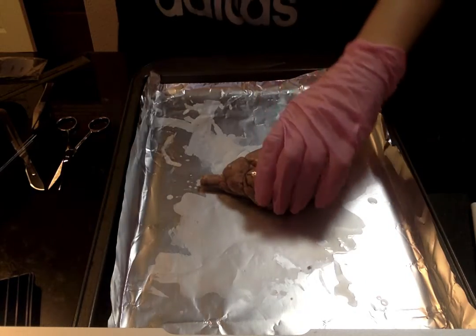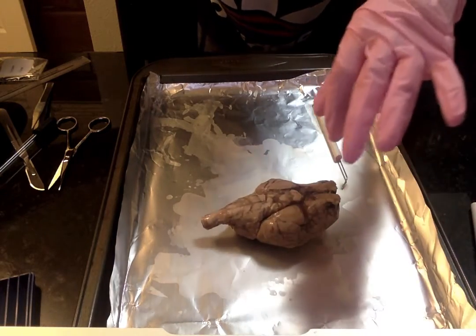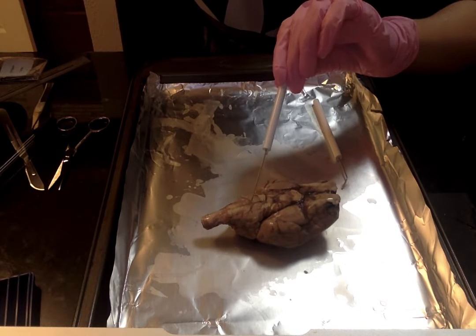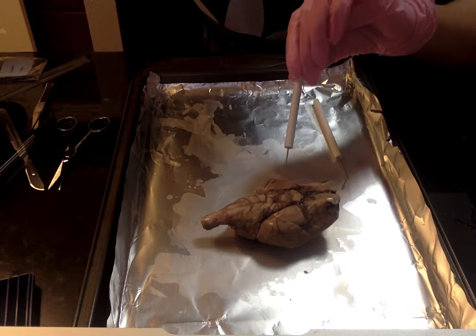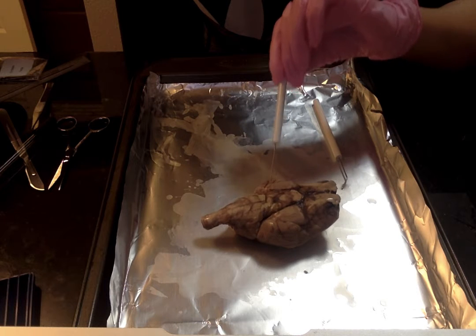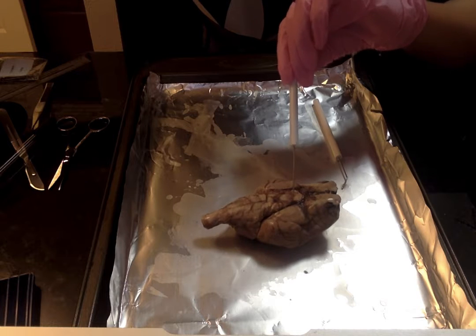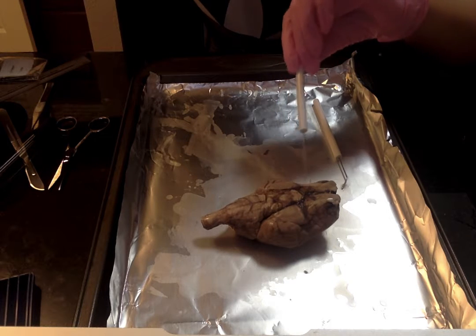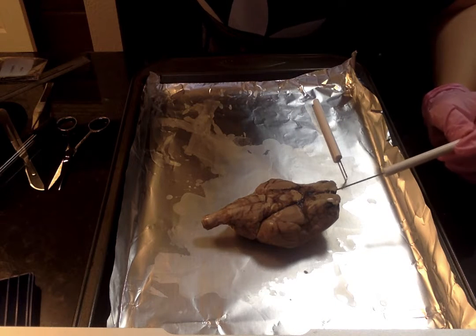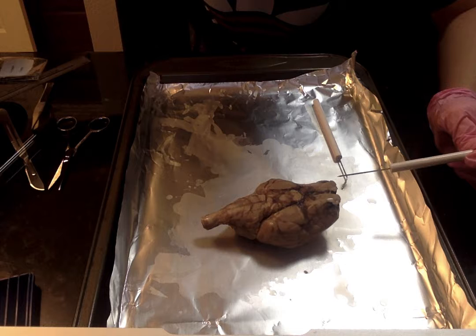So I'm going to turn the brain over now, and we're going to see, let me grab my little probe here. We can see the medulla again, and this is the pons area, right around here we have the pons, and the midbrain is going to be right here in this area, the middle brain. Optic chiasm also right in this area, and then the olfactory bulbs right here. This would be where the face of the sheep is.